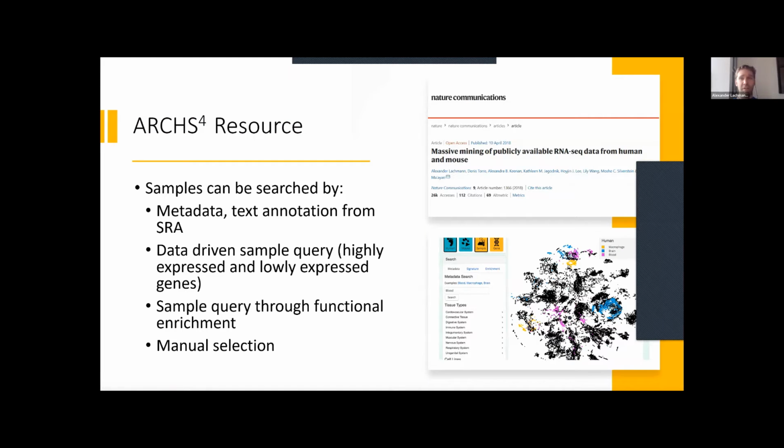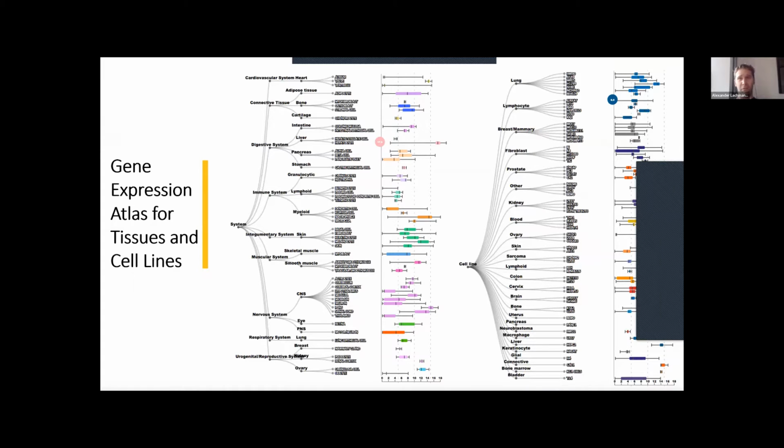So the resource itself basically just tries to build large pre-aligned gene count tables that people can use. We use this H5 data format, which is nice for programmatic access. But then we also have APIs that try to serve the data on request. And we pull metadata from GEO and then also inject that into those data files. We really started this project because we wanted this data for our own purposes. So you can do a lot with that.